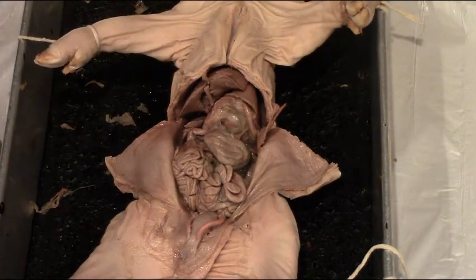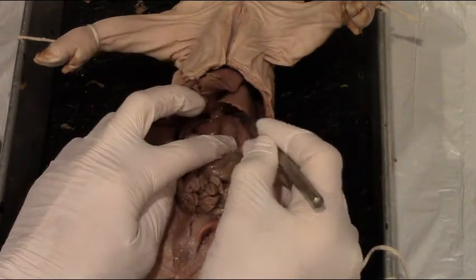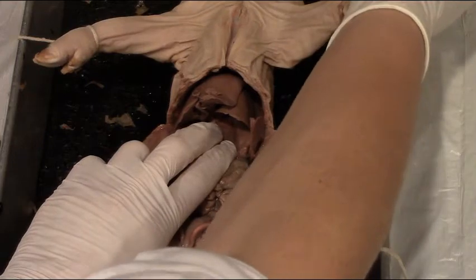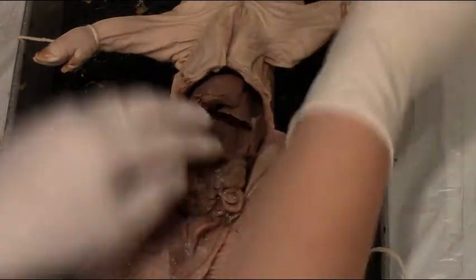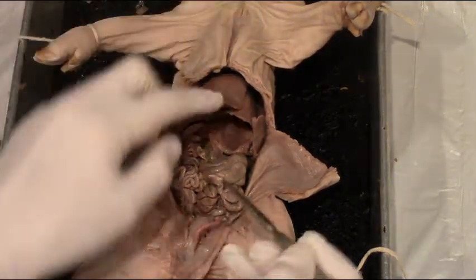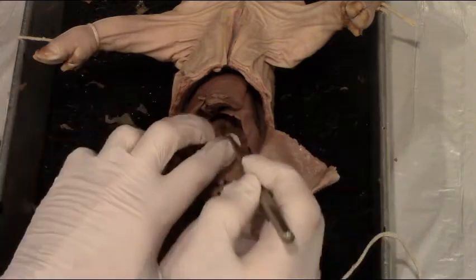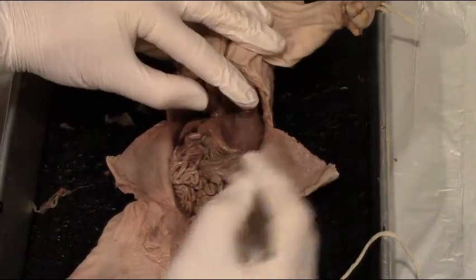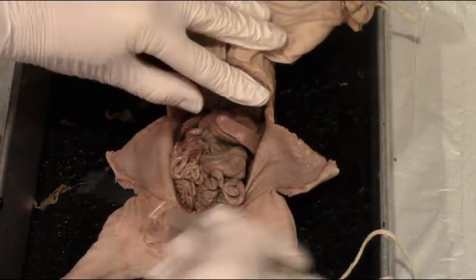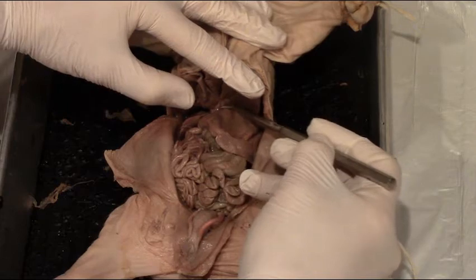A couple of other structures we can observe in this area. If we push down on the stomach, we can look for the esophagus. When the pig ingests food, it swallows it, and the esophagus takes food from the mouth all the way down to the stomach. The esophagus runs dorsal to the liver, so we won't see it very well here, but we can see where it feeds into the top of the stomach by pushing the liver up and the stomach down.